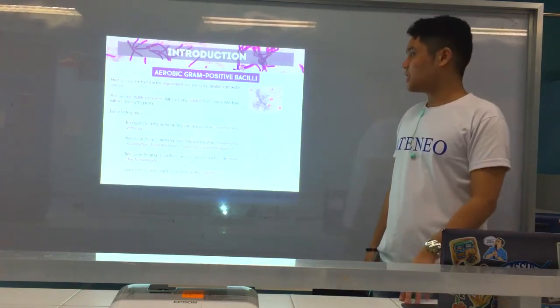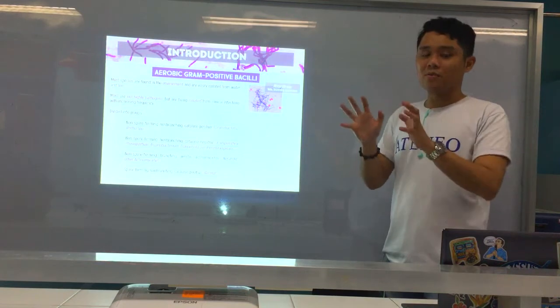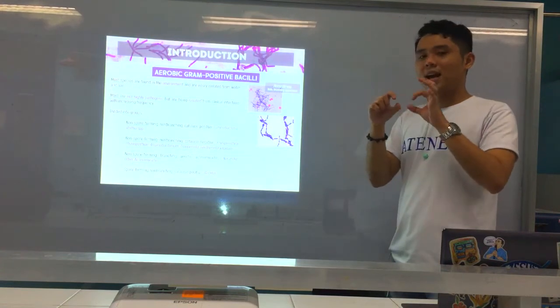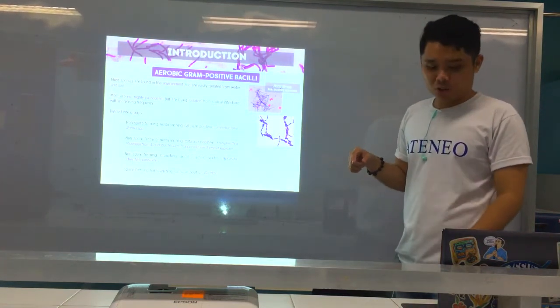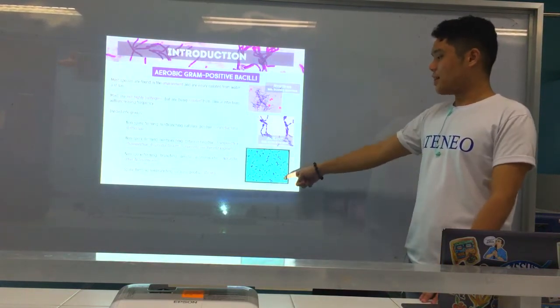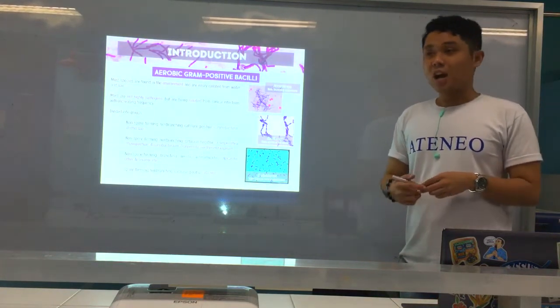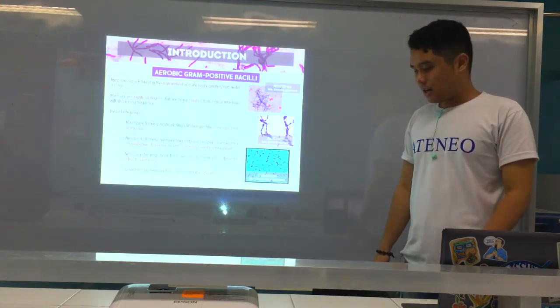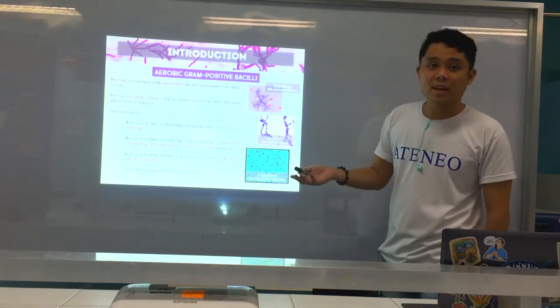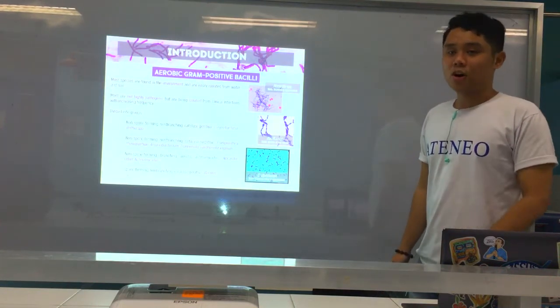Here are examples of pictures. This is Nocardia. As you can see, it is branching and filamentous. Next, the ovals in the middle are spores, and this is Bacillus, with spores at the center. And this is Corynebacterium diphtheriae. Remember, Corynebacterium diphtheriae has a Chinese letter appearance. If under gram staining or a case study they mention Chinese characters, press the buzzer: that's Corynebacterium diphtheriae or Corynebacteria.